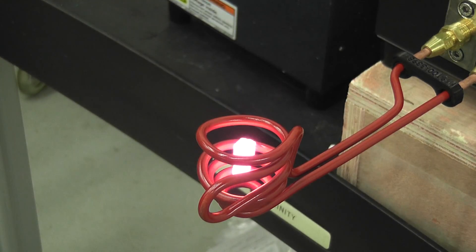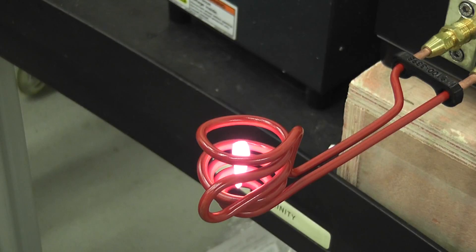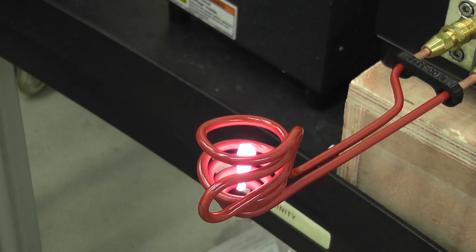This is aluminum. So what would you prove? You would prove that a material is a pure something? Yeah, because what you're actually doing, you are melting a material without any touch, any external touch. So it's pure to be analyzed. It's always fun to look at levitations. Everybody likes that. And it's so simple. And it's glowing, glowing levitations.